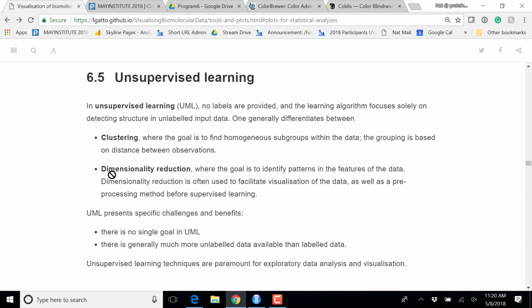So these are called unsupervised, as opposed to supervised machine learning or class prediction, where we have some sort of annotation. We know that these samples are healthy, these samples have disease, have a condition, and this other sample I don't know, so I'm going to compare its data and try to label it. That would be supervised machine learning, such as classification or regression, and Olga called these class prediction.